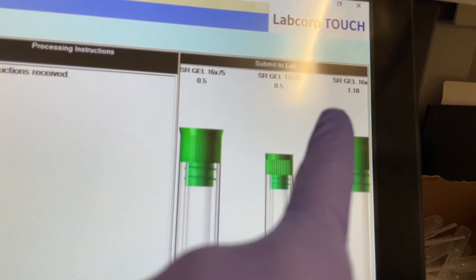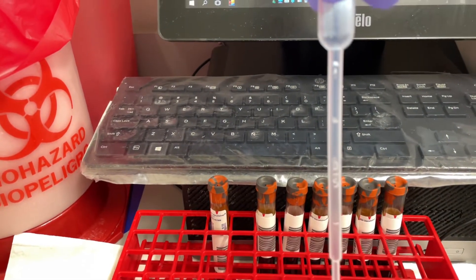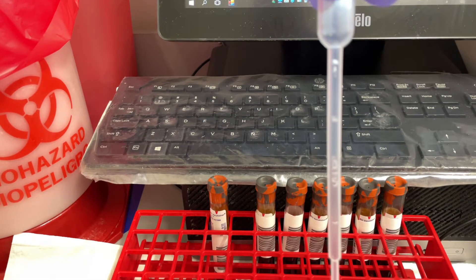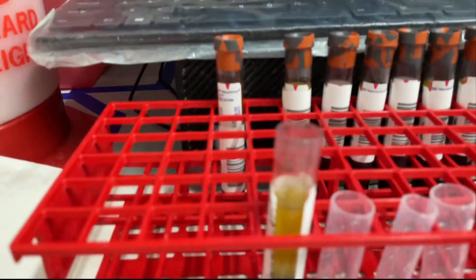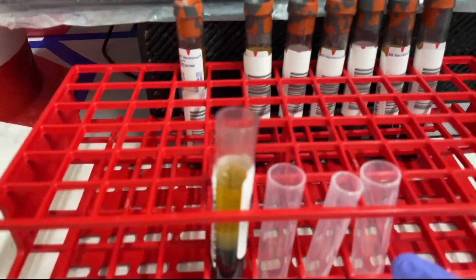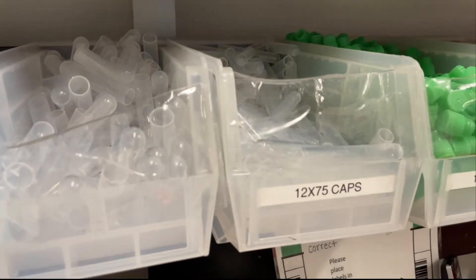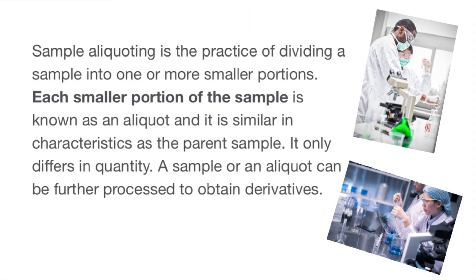As you look at this computer screen, it gives me instructions. We're going to go over those instructions and then pipette the fluid into various tubes. My pipette reads 0.5, and the screen says 16 by 75 — 0.5. So we're going to pipette the fluid and put it in the 16 by 75 tube, putting 0.5 into that clear 16 by 75 tube.